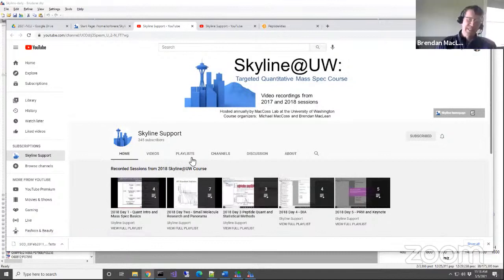And then by day 4, we're transitioning to DIA, and you may go, oh yeah, I went over some of that, but there's a lot of DIA background that you might still be interested in there. So that's definitely worth looking at.